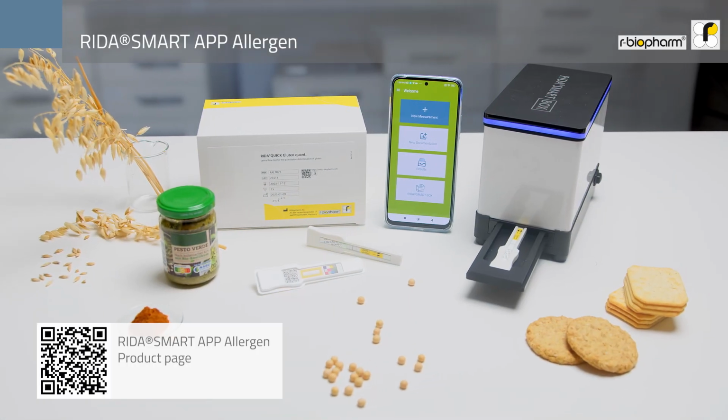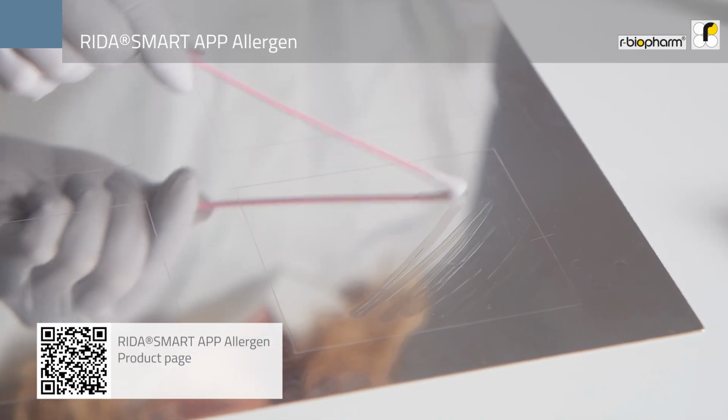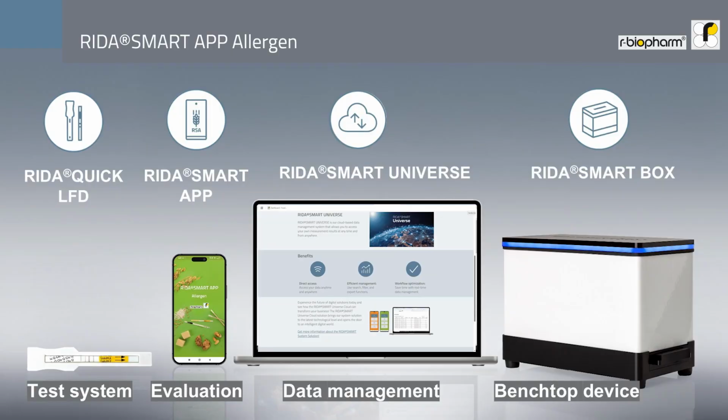With our overall solution in quantitative allergen analysis with lateral flow tests, we support you from testing to data analysis and data management, helping you to remain flexible in your daily testing routine.